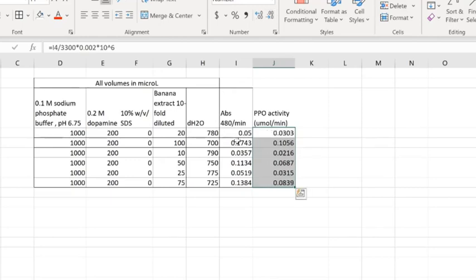The absorbance per minute slopes are often provided with 4 digits, but that's in the end also too many digits because the accuracy is also hampered by the accuracy of your pipettes, the titration. So in the end, we need to trim down to 2 or 3 digits for our very final result, maybe showing 3 digits, but only 2 digits at most will be significant.